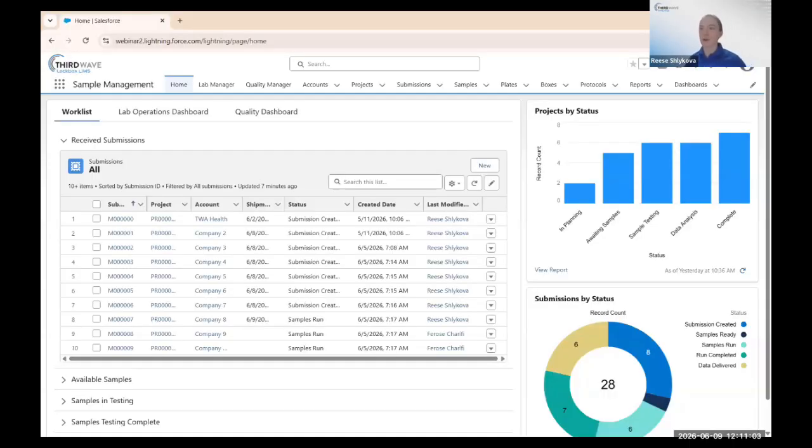Wonderful. Thanks, Linda. I'm going to take that screen share. And I see lots of activity in the chat, which is amazing. We've got two team members here, Jennifer and Feroz, who are going to be actively responding to those questions. So please feel free to keep the questions coming. Anything that we would like to show you that might be a good answer to a question, we can also do during the Q&A. So definitely stay tuned for that Q&A period where we're going to go into even more detail to answer these questions.